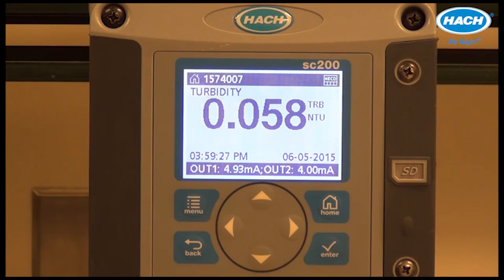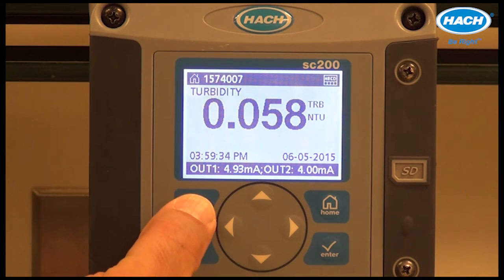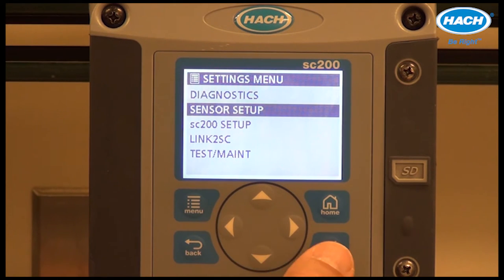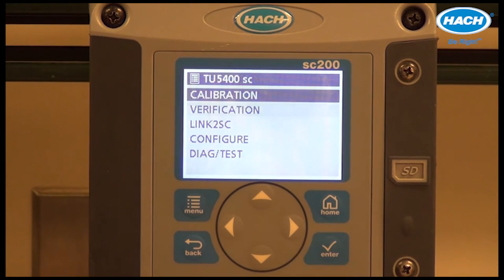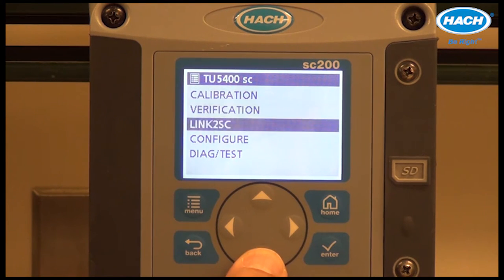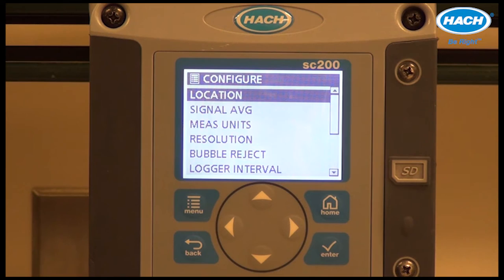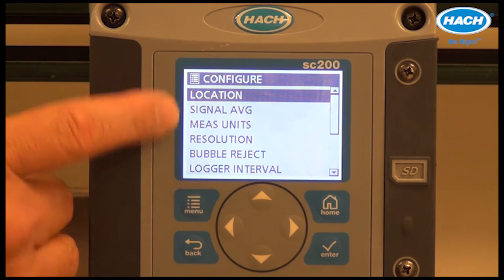Additional operational settings are located in the sensor configure menu. We'll start by pressing the menu key, scrolling down to the sensor setup menu, pressing enter, and then scrolling down to the configure menu where many of the operational settings can be selected and modified. Let's start at the top.